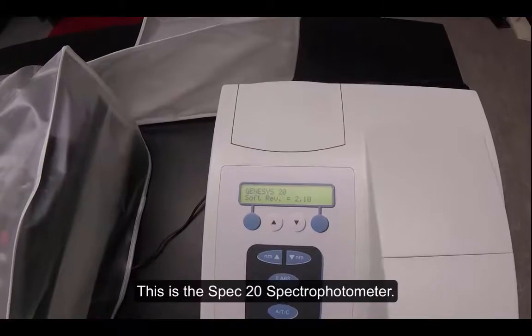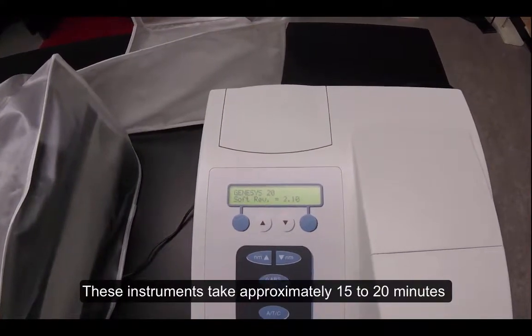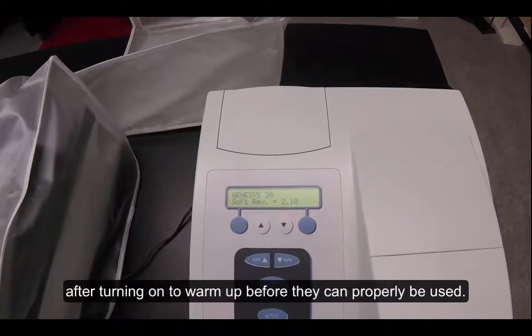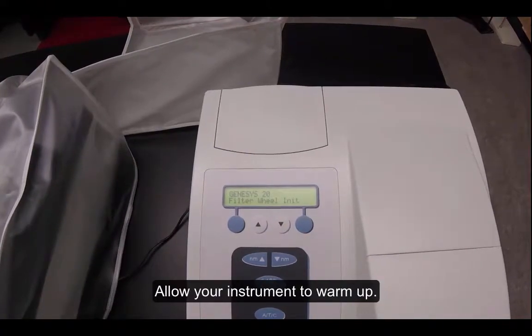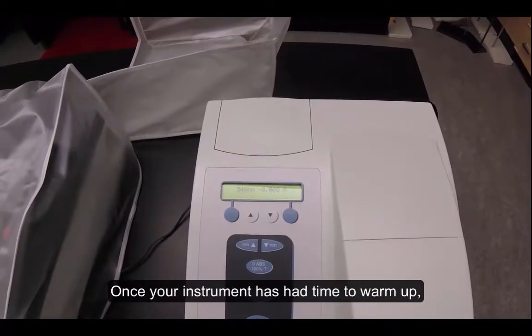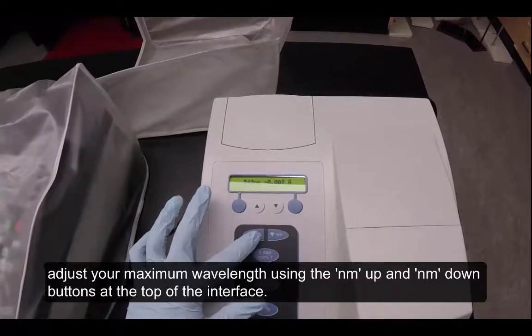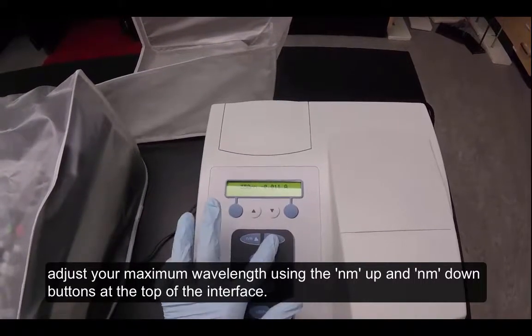This is the SPEC20 spectrophotometer. These instruments take approximately 15 to 20 minutes after turning on to warm up before they can properly be used. Allow your instrument to warm up. Once your instrument has had time to warm up, adjust your maximum wavelength using the NM up and NM down buttons at the top of the interface.